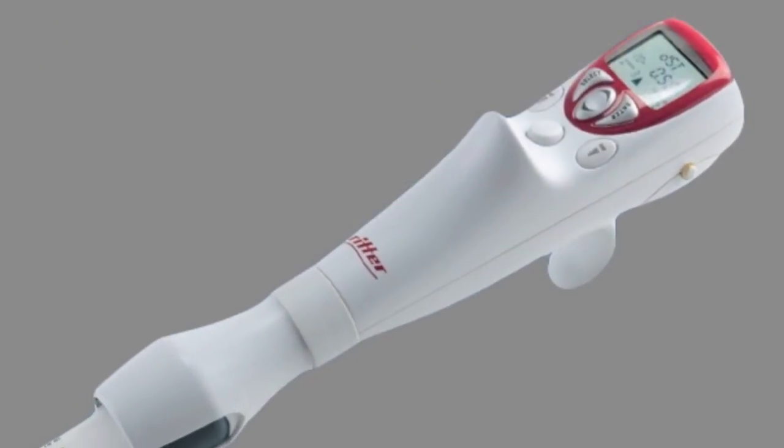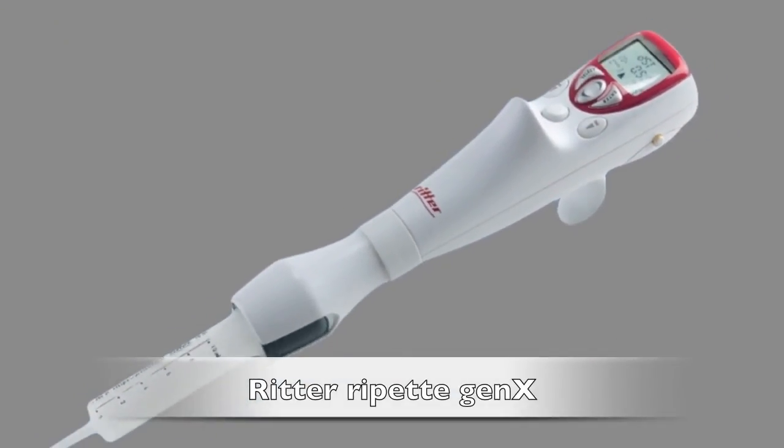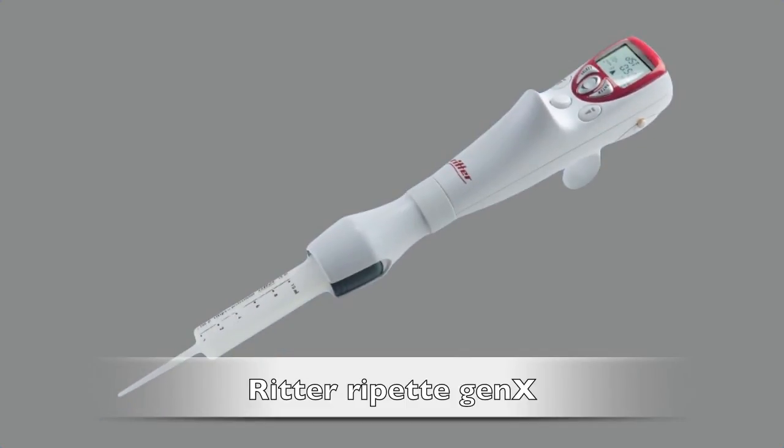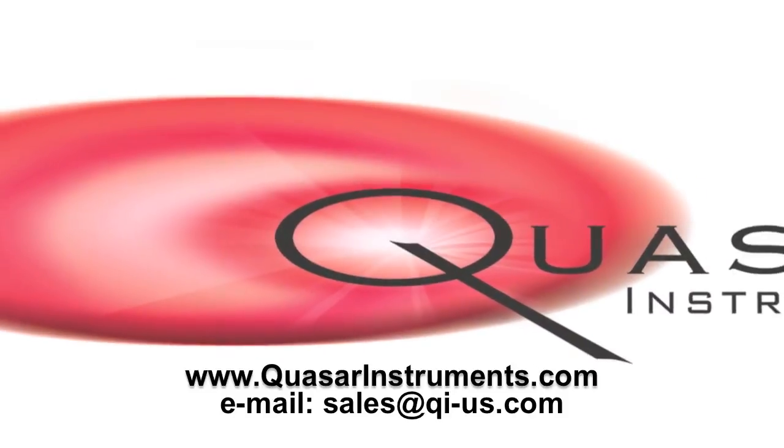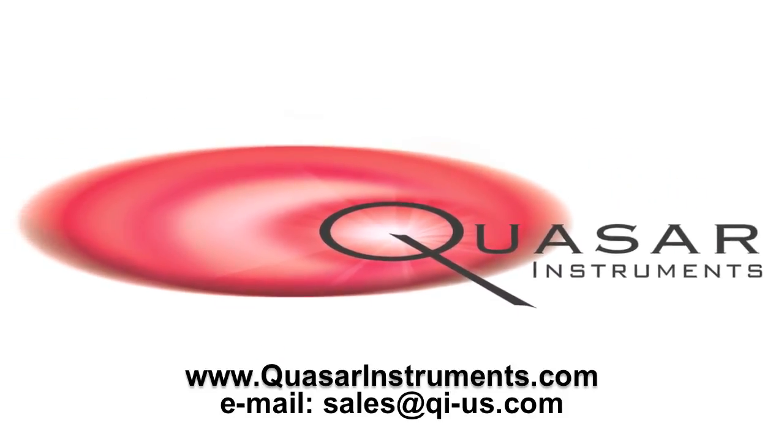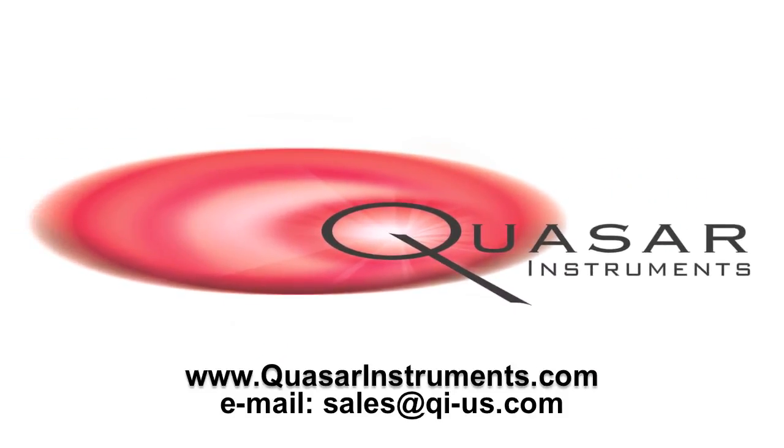Along with the large volume range, the Ritter Repet Gen X is also ideal for viscous or volatile samples. If you need more information, please visit our website at www.quasarinstruments.com. Thank you.